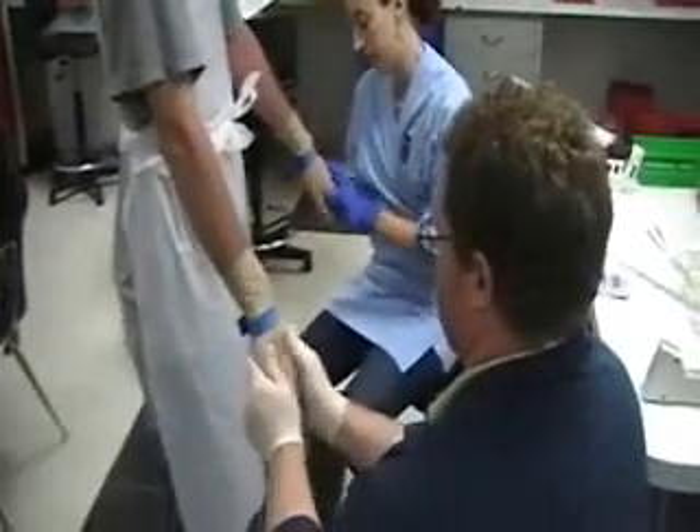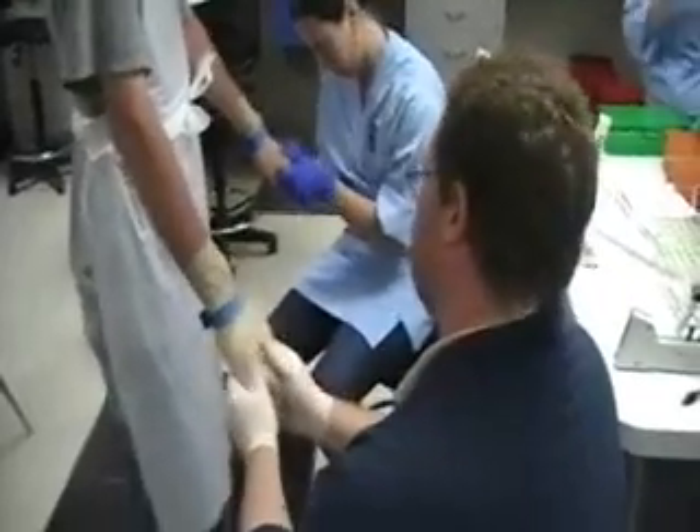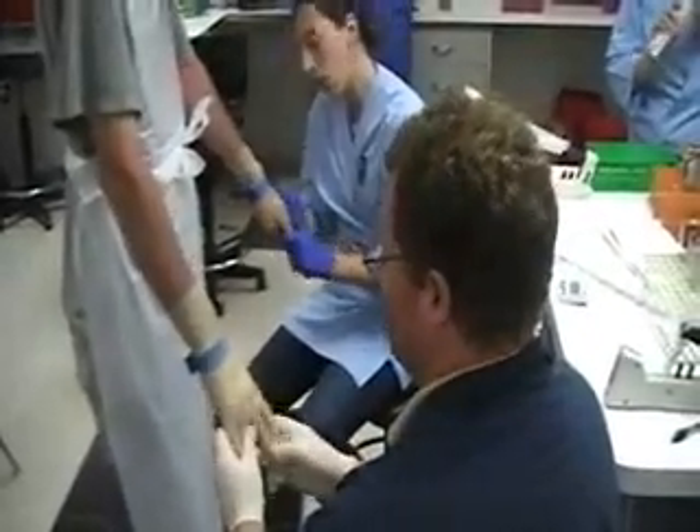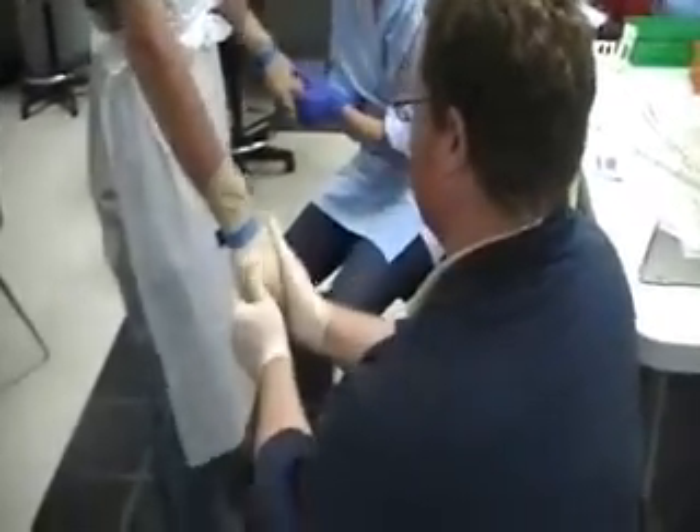Timers are set. Vigorous massage begins. Is that a two-minute massage? No — a one-minute massage of all surfaces of the hands.